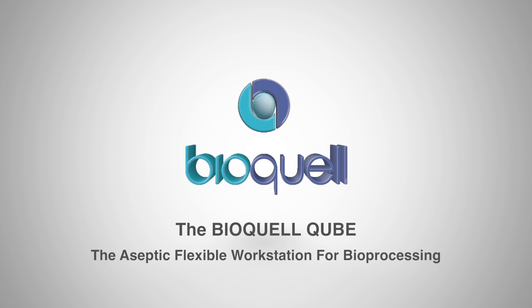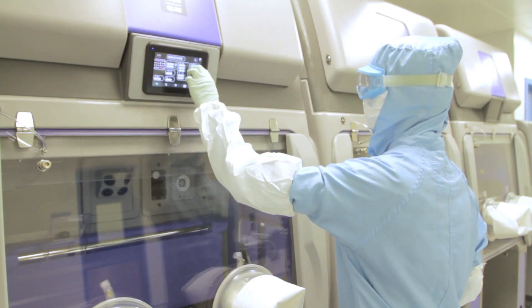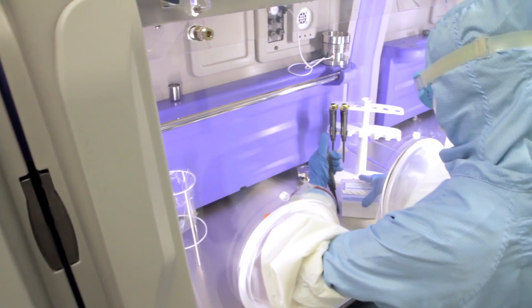Introducing the BioQuell Cube. The Cube is an aseptic, high-quality, low-cost workstation perfect for a variety of applications in the pharmaceutical, bioprocessing and healthcare industries.